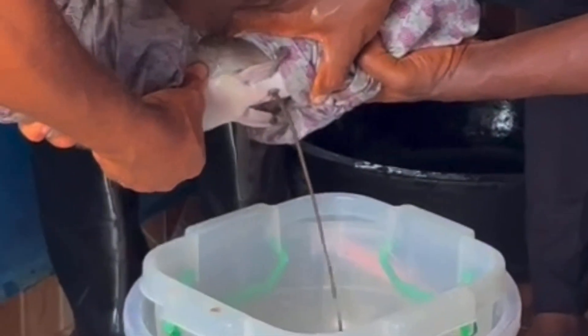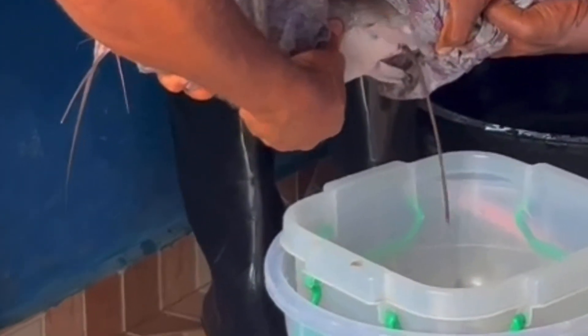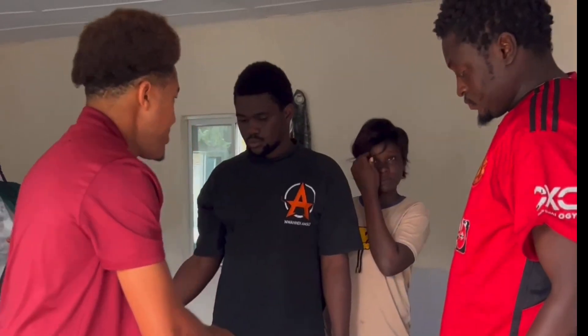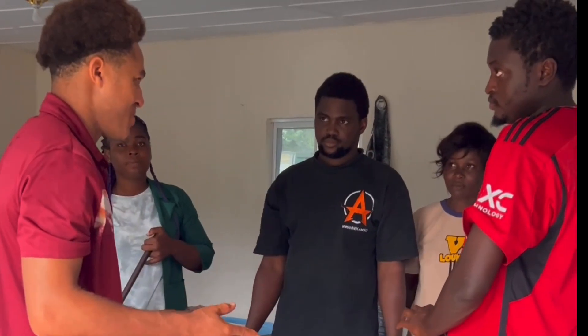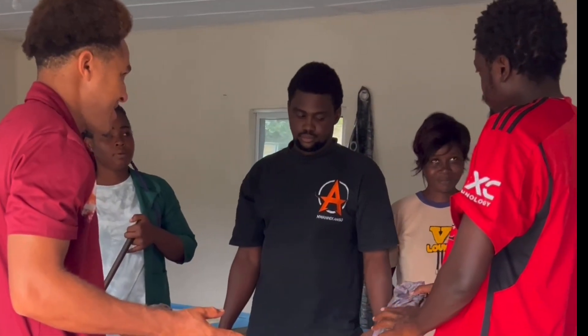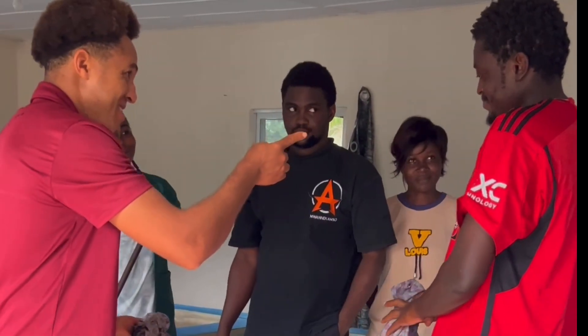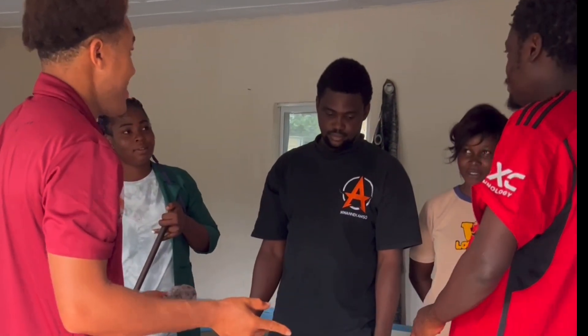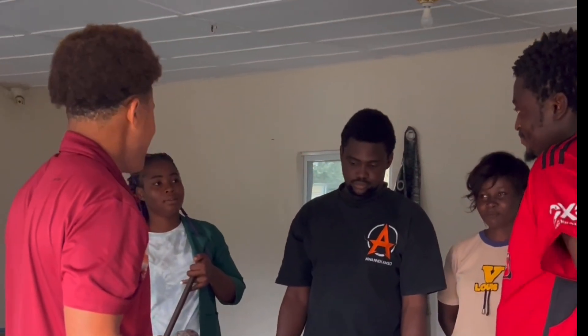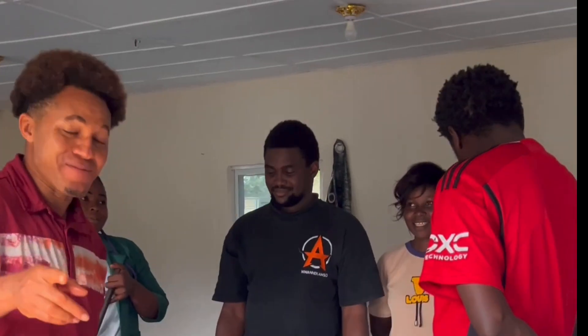These are the fish being stripped. After the injected fish have been left for about nine to ten hours, we strip them. Let me ask the person behind the camera — after stripping, how is the fish called? The eggs have been gotten out of the fish.